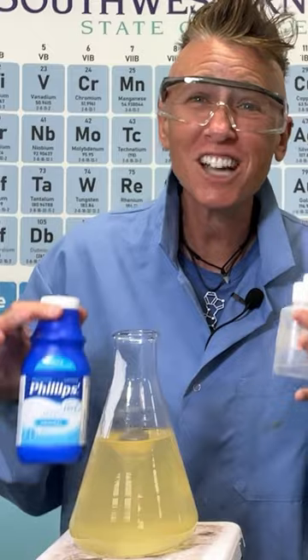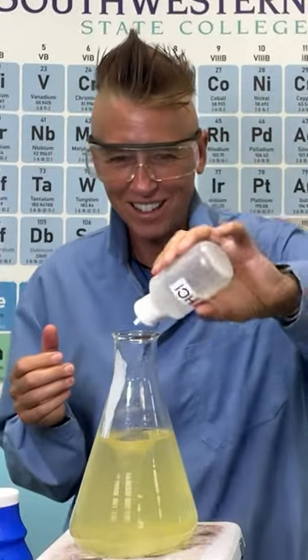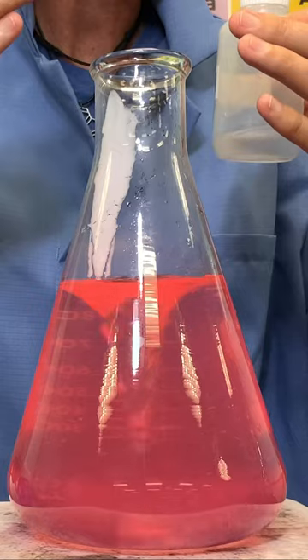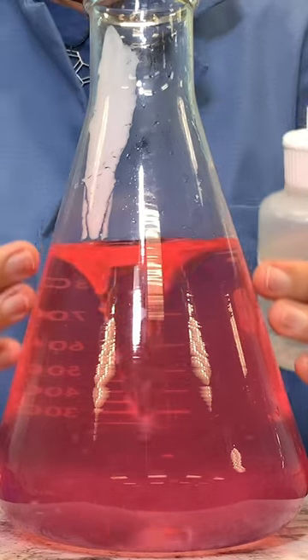This is incredible — these color changes are mind-blowing. As the reaction continues, more magnesium hydroxide dissolves. I have a stir rod inside my flask, and you're going to be able to see the vortex now that's being created by that stir rod, and the clarity of the solution.